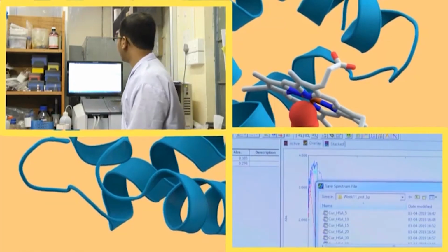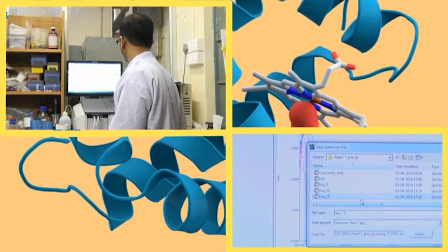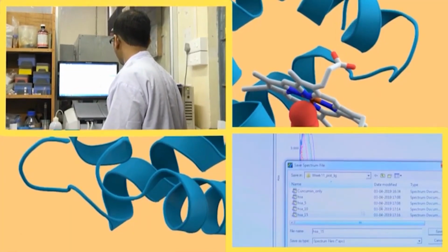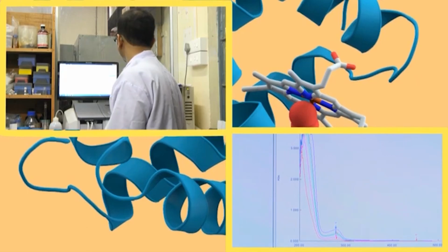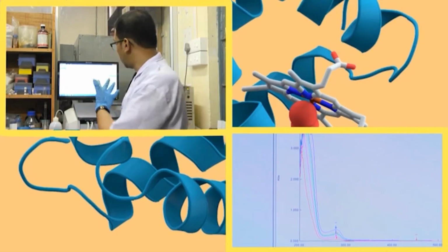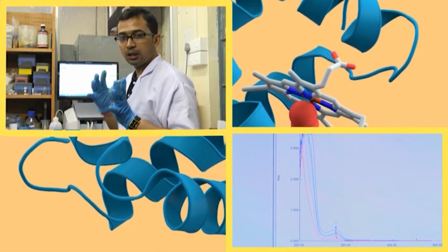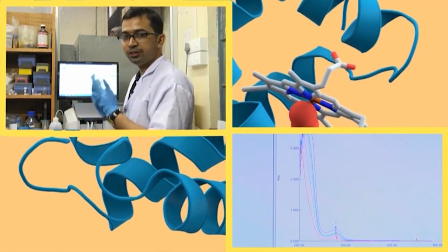Now, I am saving this one as HSA 30. Actually, I have to save the previous one also, but I am currently saving this one. I am showing you a small instrumental technique, for when you forgot to save any data or spectra at the time, but will save it in a later part.